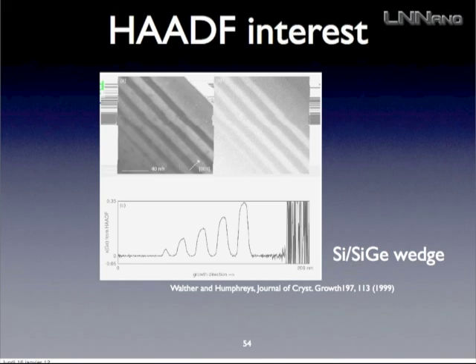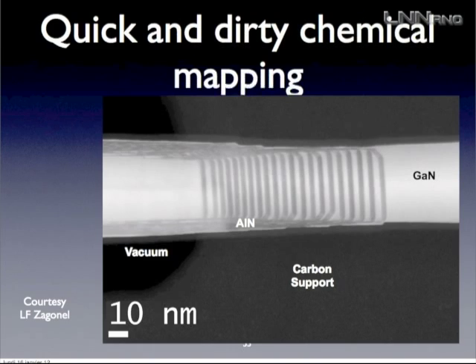What is the HADF? That's a good point. It's here. So these are places where there is germanium, if I'm not saying something stupid. This has been normalized by the thickness, and you can be even quantitative in the determination of the composition. But you have to be very careful when doing that.